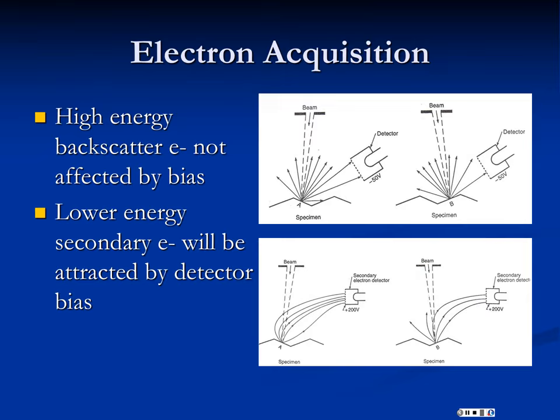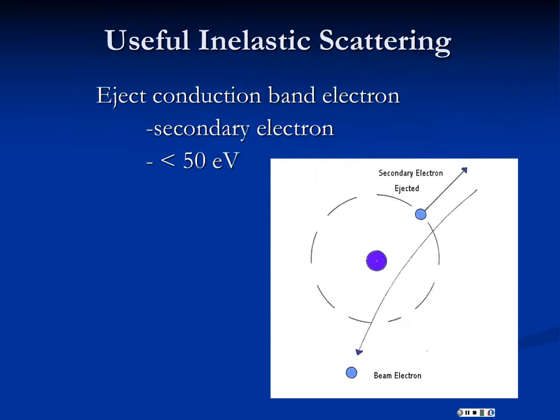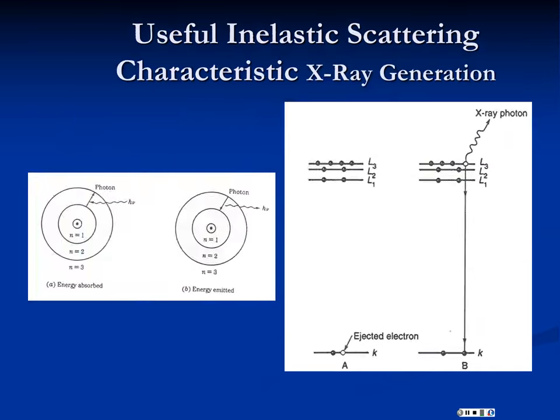When we're taking a picture, we have to basically count the number of electrons coming from every point on the surface as the beam scans. For backscatter, we're going to see the electrons that bounce to the detector. Now you notice this detector has a polarization. They put a negative 50 volt potential on it. The reason you do that is secondary electrons, if you remember back, all the way back, sorry. Oh, wait a minute, where was it?